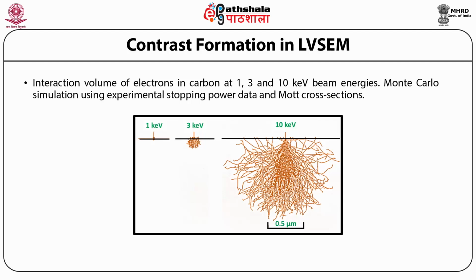exposed by the incident beam irradiation, leading to enhanced secondary electron emission from all the free surfaces of the feature. The 20 to 30 kiloelectron volt micrograph shows all the expected features of a typical secondary electron image, contrasting from the topography of the sample surface, edge brightness enhancing the shape of features, and a three-dimensional appearance that makes easy interpretation of the image.